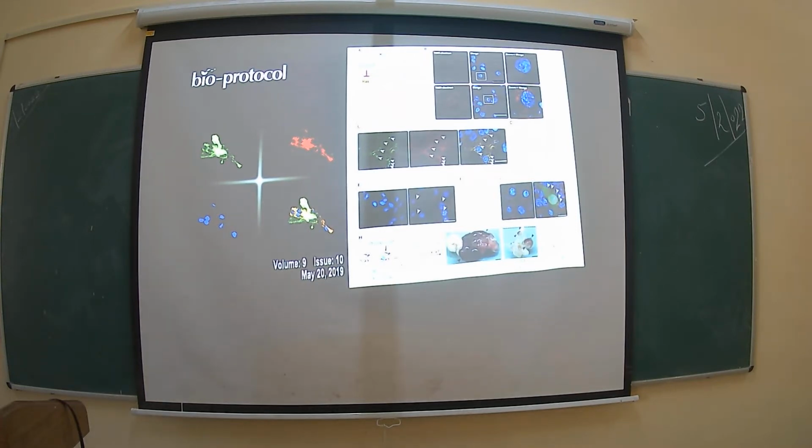Here you can see this is the nucleus and this is the cytoplasm, and I am showing that near the nucleus some phenomenon is occurring. All these pictures were taken by me, and this was published in one of the journals, the Journal of Clinical Investigation.